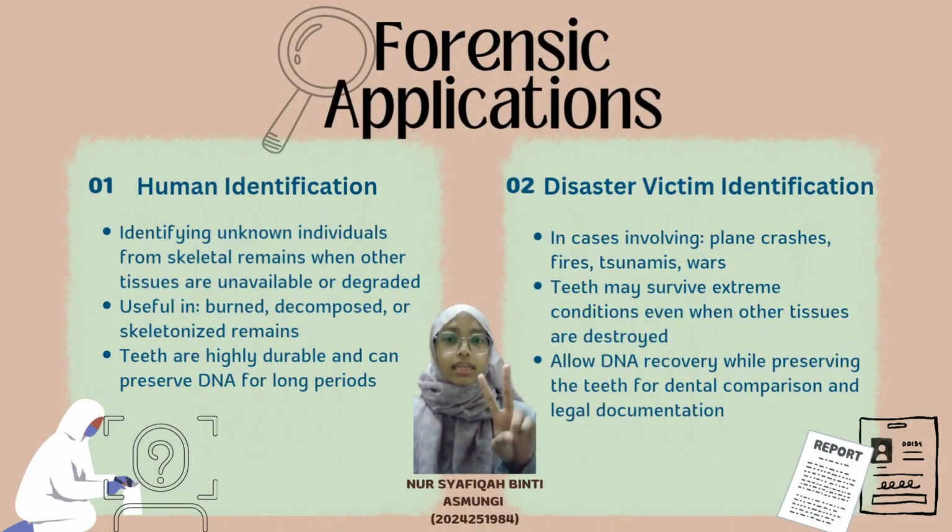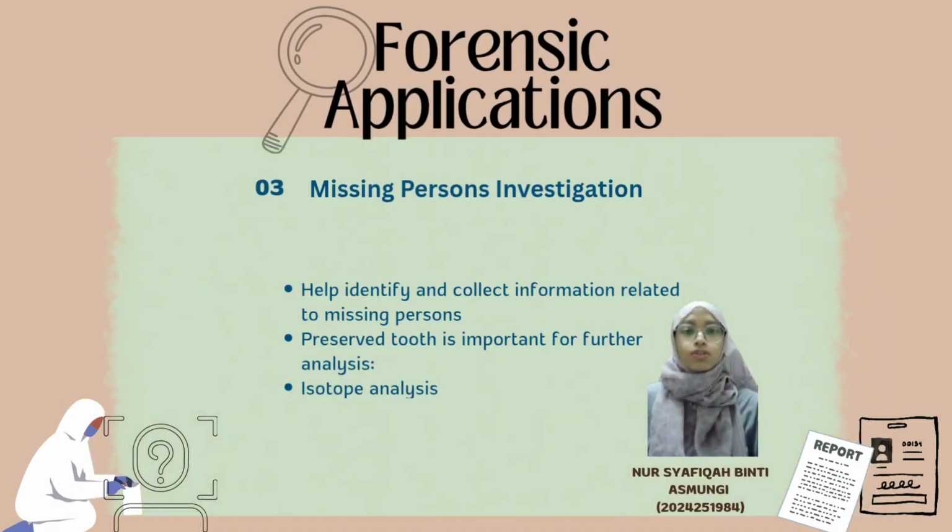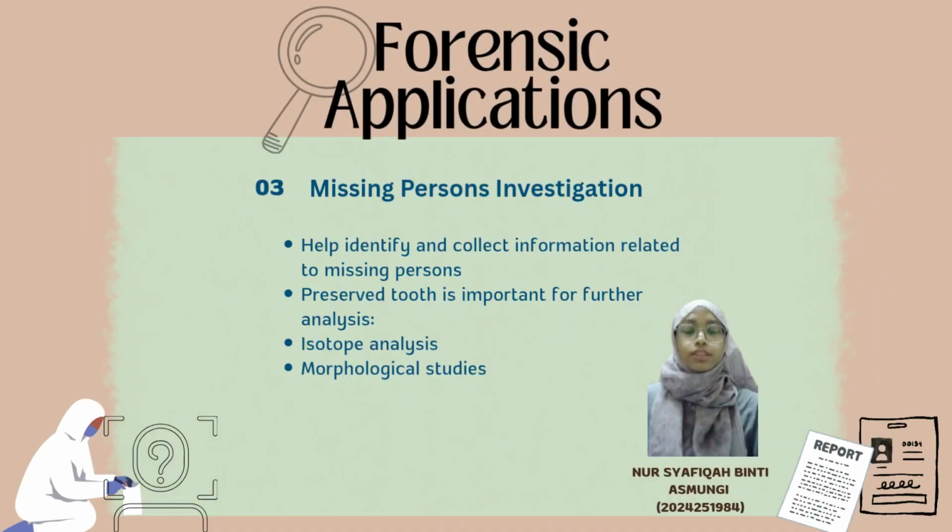The second is disaster victim identification, in cases involving plane crashes, fire, tsunamis, and war-related incidents, because teeth may survive these extreme conditions even when other tissues are destroyed. This allows DNA recovery for dental comparison and legal documentation. The method is also valuable in missing person investigations where preserving the remains is important for further analysis such as isotope analysis and morphological studies.